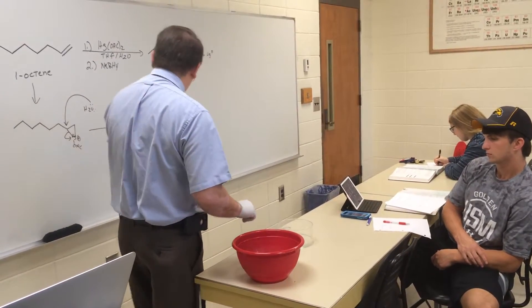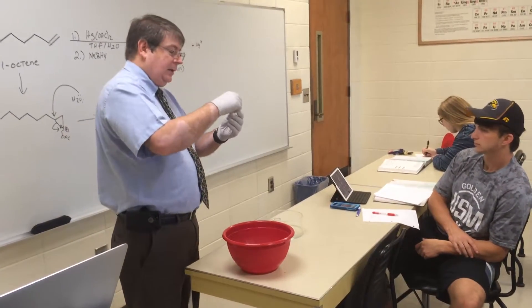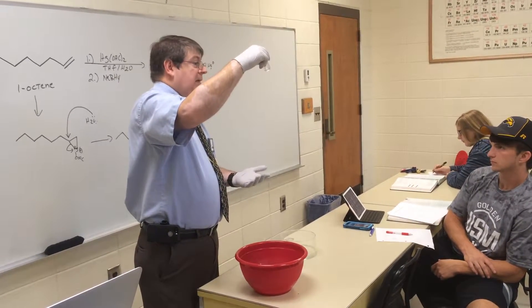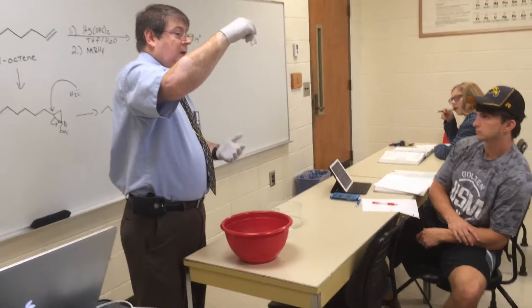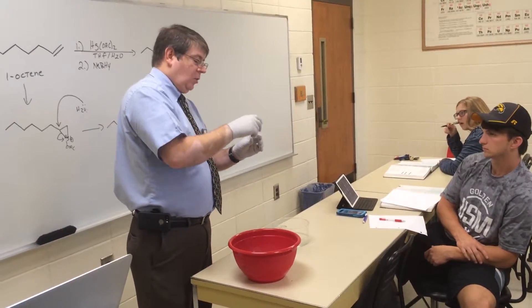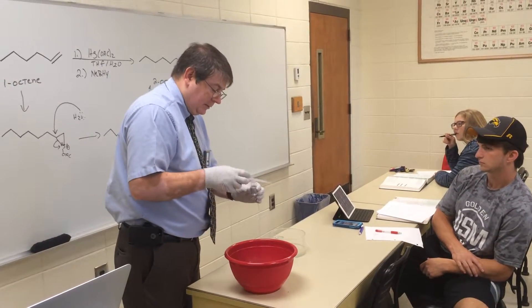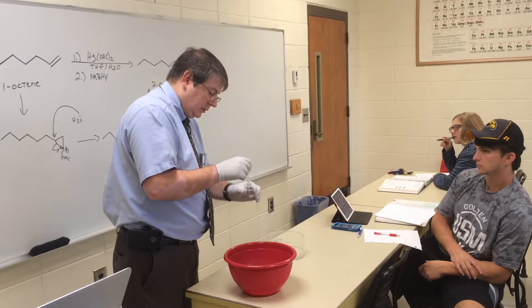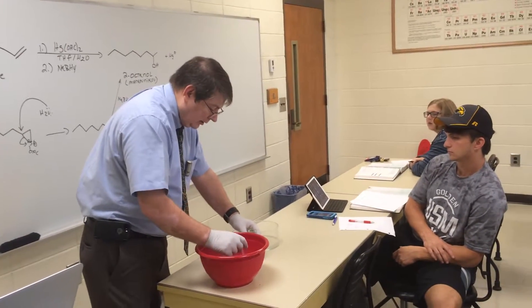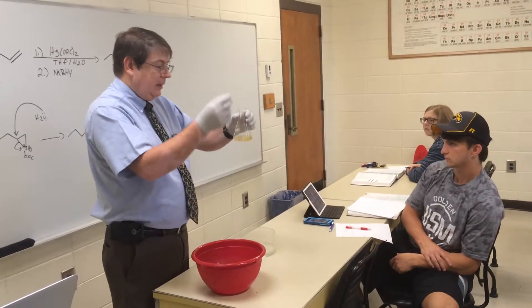So now what do I do? I add the sodium borohydride. This sodium borohydride is dissolved in water that's basic — it's three molar sodium hydroxide. The whole purpose of the hydroxide is to allow the sodium borohydride to be stable. I've got about 15 mils of that, and we need all of it to go in. This part can get exothermic, so I've got a water bath here to cool things, and we'll start off by adding just a little bit.